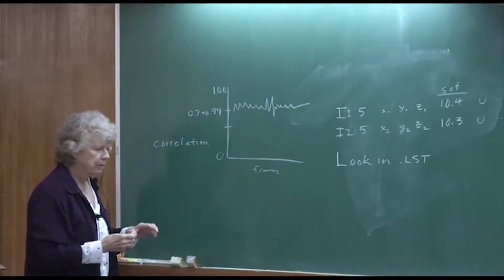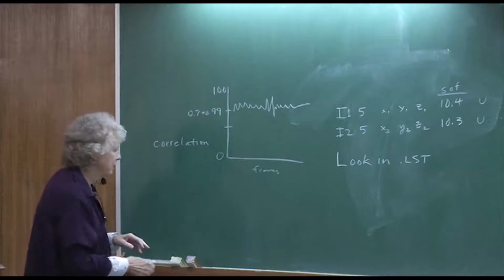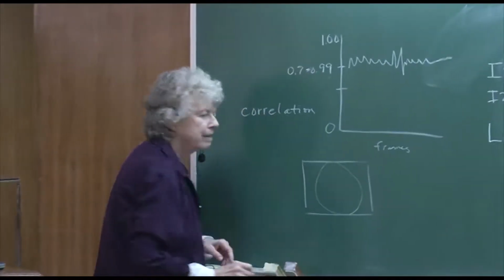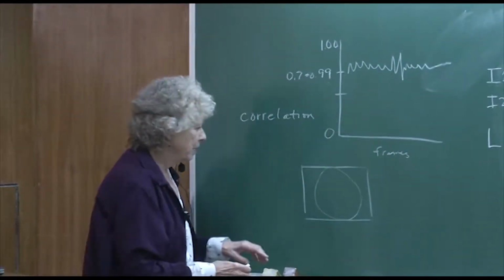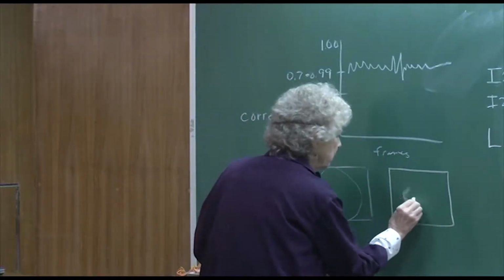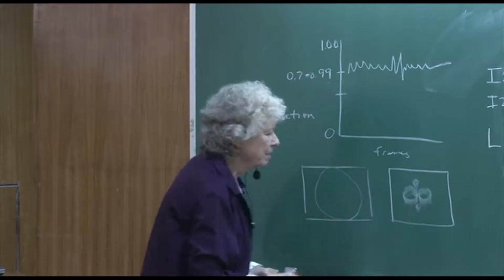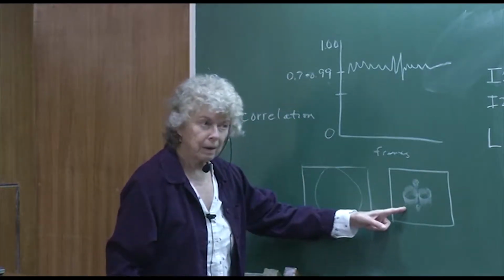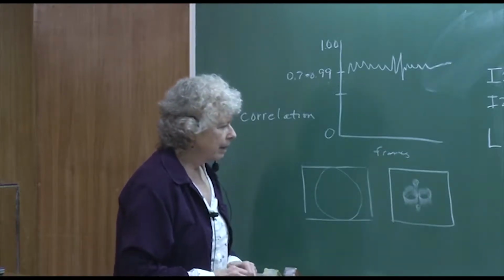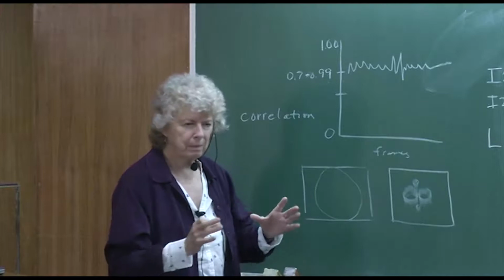Another one I really like is the one that shows the spots themselves as an image. You want it to look like the spot is centered in that box, but sometimes it doesn't look like that. It looks more like a big blur and another one really close to it, or maybe even more. That's usually a sign of twinning or cracking in your crystal. So if it's cracked, you might need to fix the box size when you do the integration so that you actually encompass the whole thing.